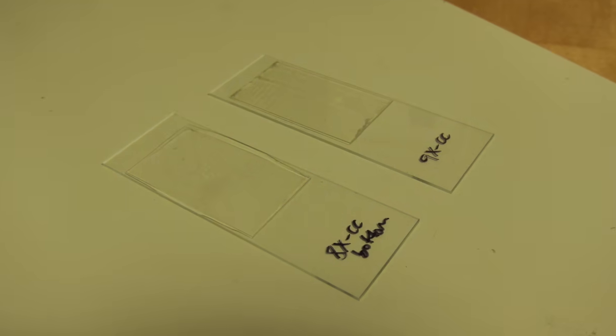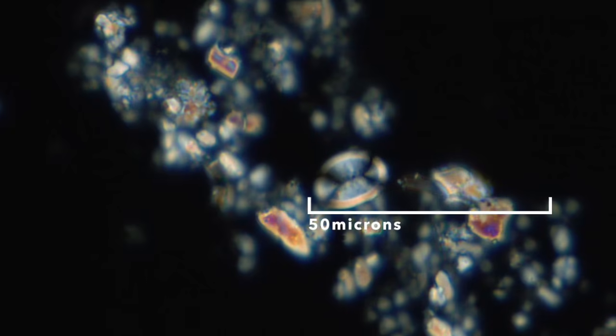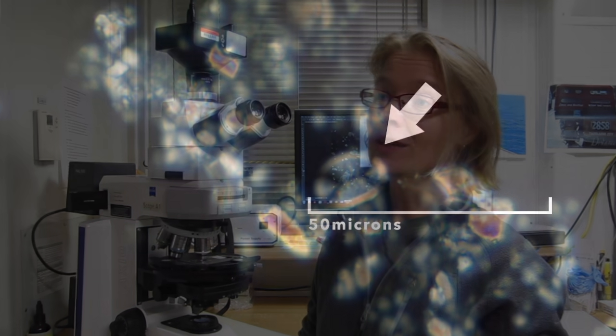And we look at that in so-called smear slides and then look at it under the polarized light microscope, and that is normally at the magnification of about 1,000 times. So we're looking at very small things called calcareous nanofossils, and these calcareous nanofossils are derived from marine algae that have a very long and extensive and very complete fossil record, and predominantly in marine sediment, so that's why we're out here.